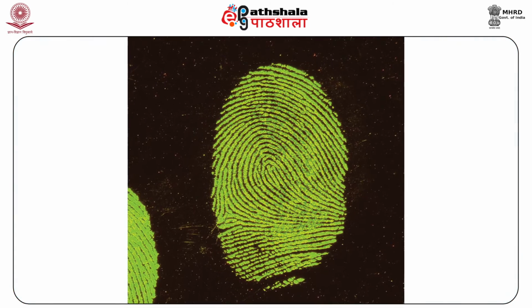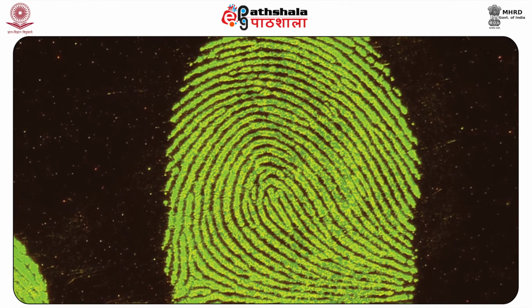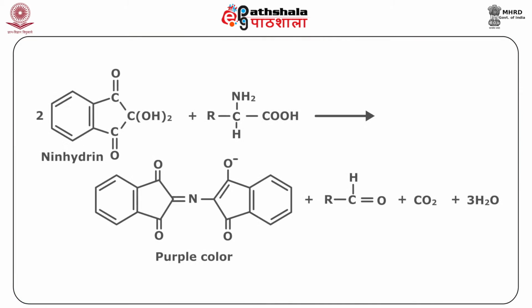The value of fluorogenic reagents for developing latent fingerprints emanates from the fact that these interact with amino acid components of sweat residue and produce luminescent products. Ninhydrin is yet another reagent which interacts with amino acid content of latent fingerprint residue. However, the product of ninhydrin amino acid interaction, Ruhemann's purple, is non-fluorescent. The reaction between ninhydrin and a representative amino acid is given in the figure.